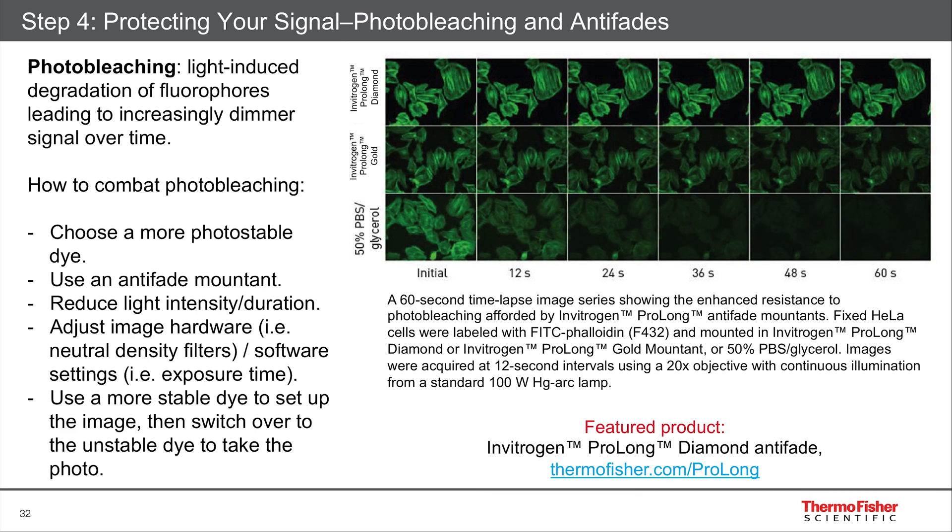But what else can you do? You want to reduce the light intensity and the duration that it's on the sample, because the more light there is — the stronger the light, the longer the light — the more photobleaching you have. So you want to be quick about imaging and about setting it up.